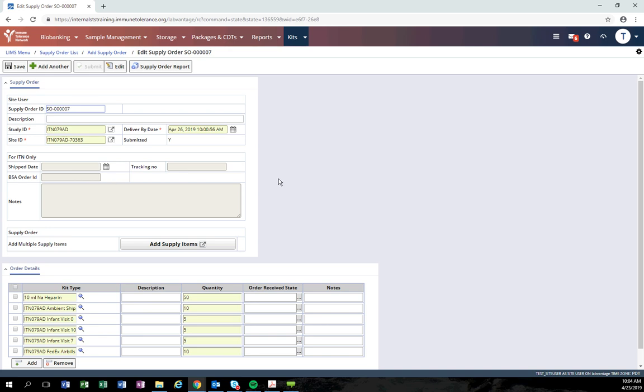You should receive the package and then verify that all items were received appropriately. If any items are missing or damaged, you are able to enter those issues into the order details table.